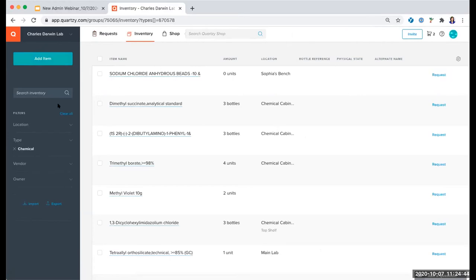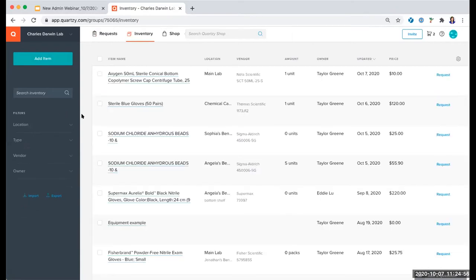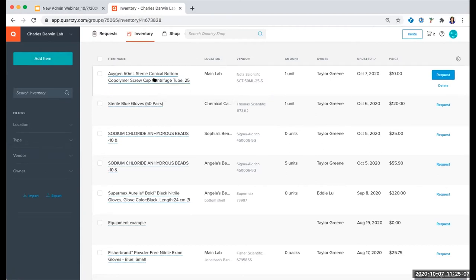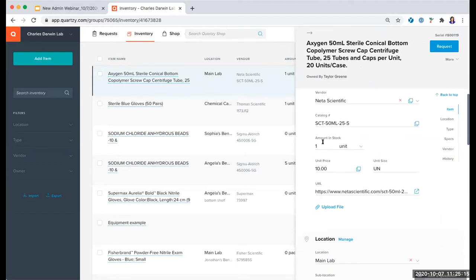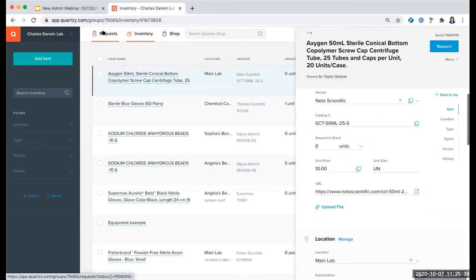Back in the inventory area, if I add any new filters I can very easily clear those to go back to my original state. Editing items in the inventory module works the same way as in requests — click on the item name and the editing panel opens up on the right. This makes it easy for members in the lab when they notice, for example, that the amount in stock field is running low. They can edit it and that information immediately saves, and they can also use the Request button to request items that need to be ordered again. You mark it down to zero and if it needs to be ordered again, you add it as a request and it links back to the New area of the request module.